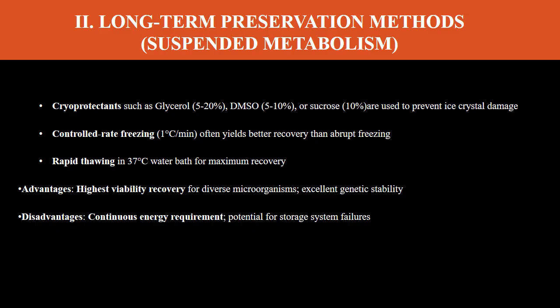The cryoprotectants used are glycerol, DMSO or sucrose, which are used to prevent ice crystal damage. Controlled rate freezing often yields better recovery than abrupt freezing. Rapid thawing in a 37 degrees Celsius water bath is used for maximum recovery.